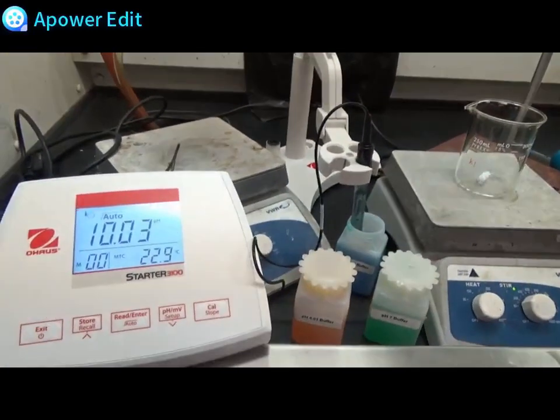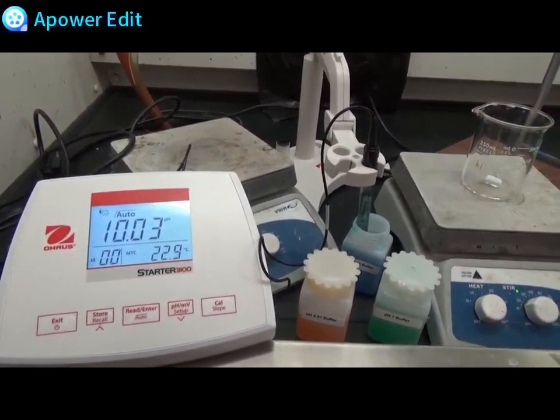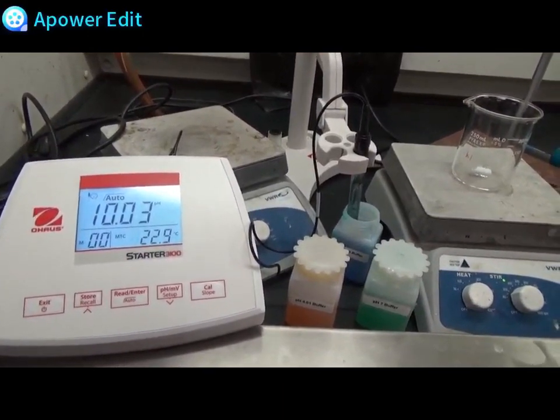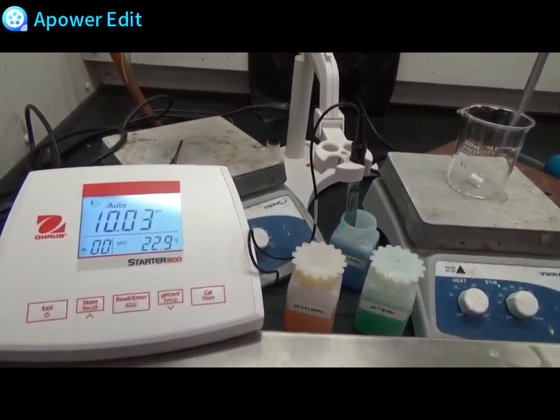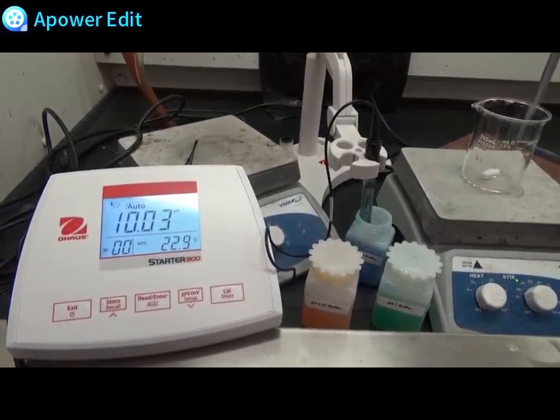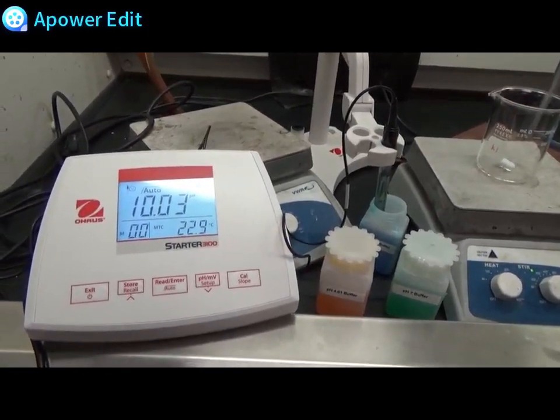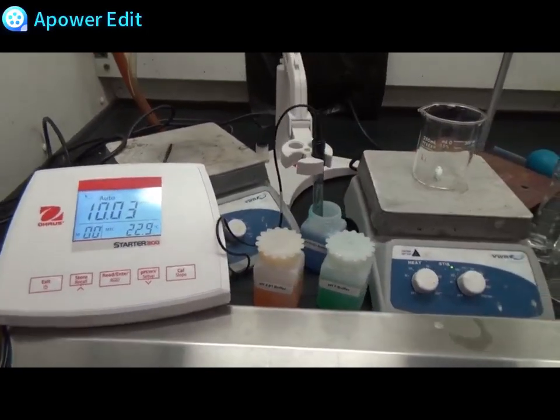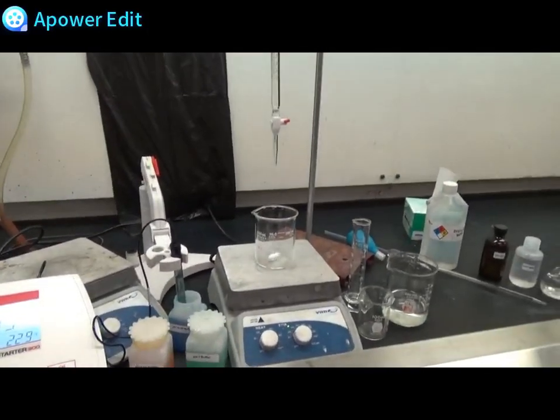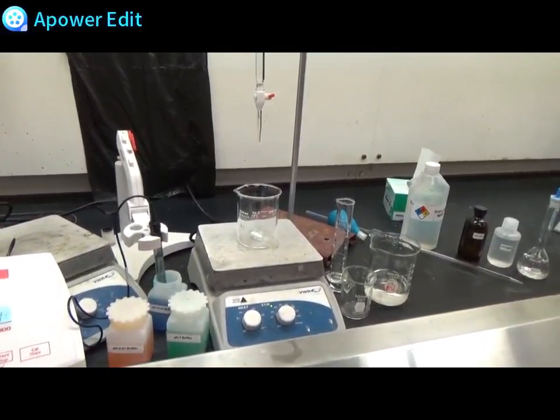This is the pH meter. I have already begun the calibration process. We have pH 4, pH 7, and pH 10 buffers. You will be given the buffers already made in the cart and they are colored for easy distinction. I will prepare the acidic solution so that we can begin the titration.